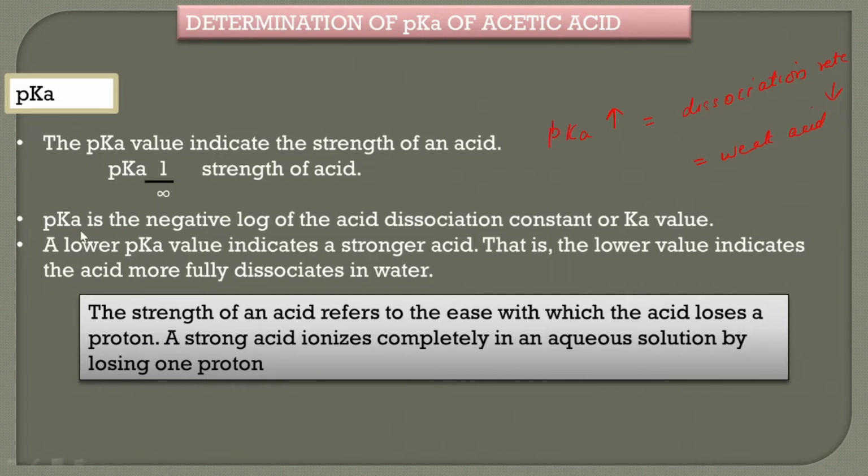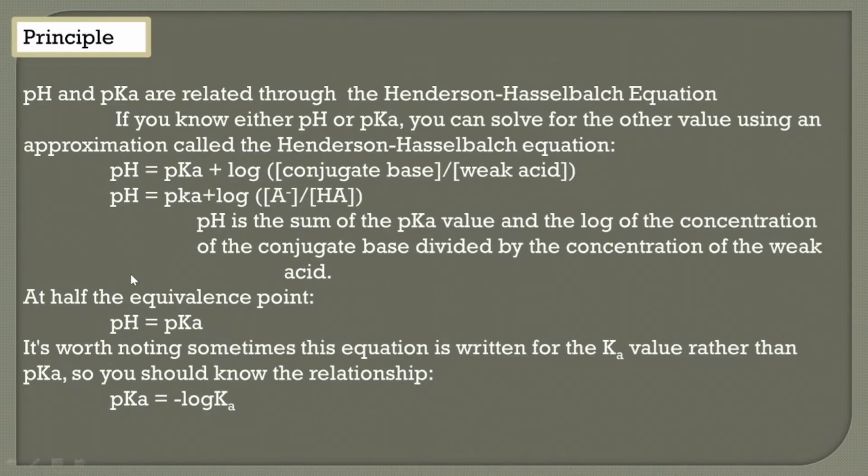Then next slide, we are going to understand the principle of this practical. In this practical, we are noting the pH at every discrete point of the titration of acetic acid using NaOH. So, how is that pH related to the pKa? It is related through the Henderson-Hasselbalch equation.